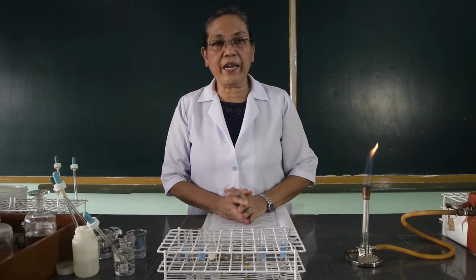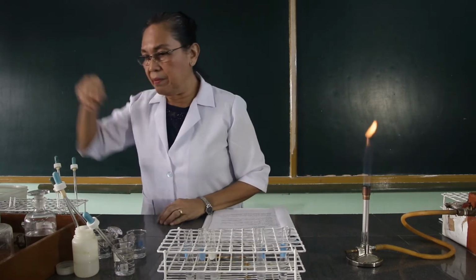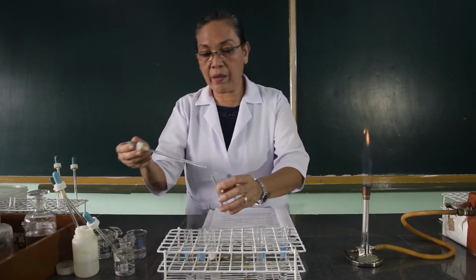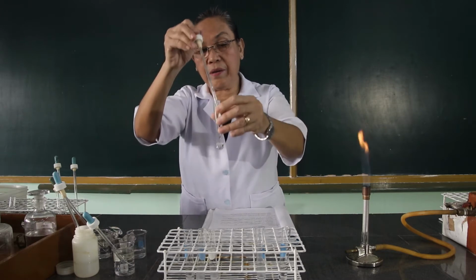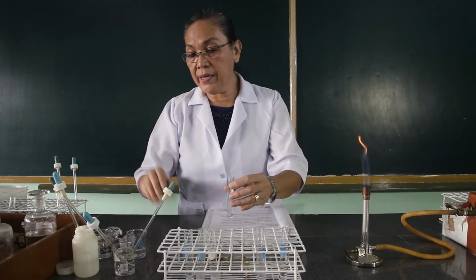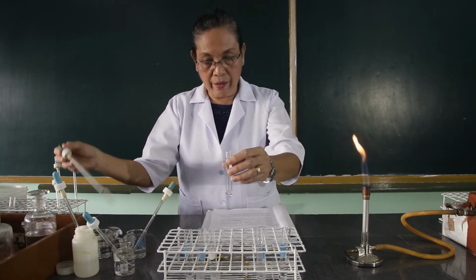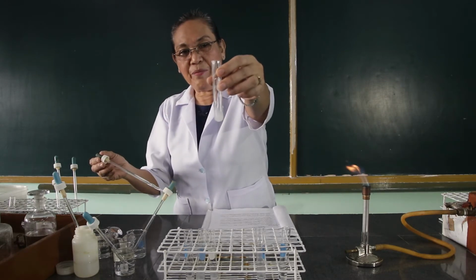The next procedure is we're going to analyze the calcium ion. So let's get 1 ml of the calcium chloride. More calcium chloride. And let's add this with ammonium carbonate. 4 drops. 1, 2, 3. Observe what happens.